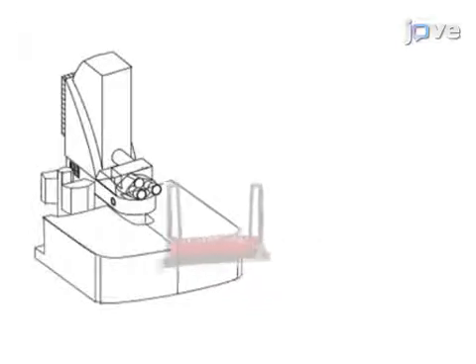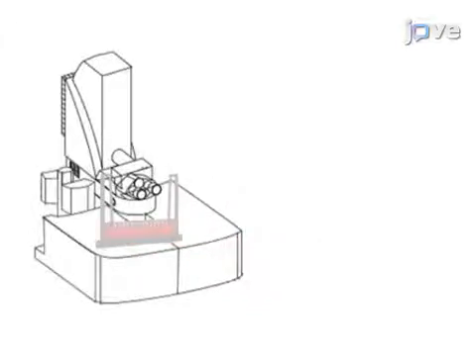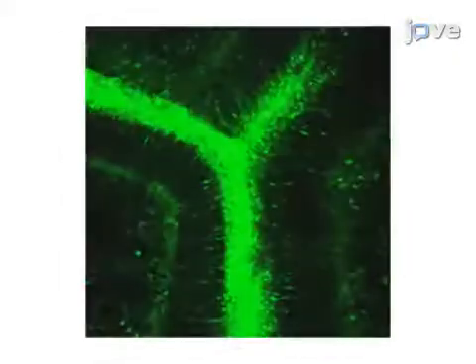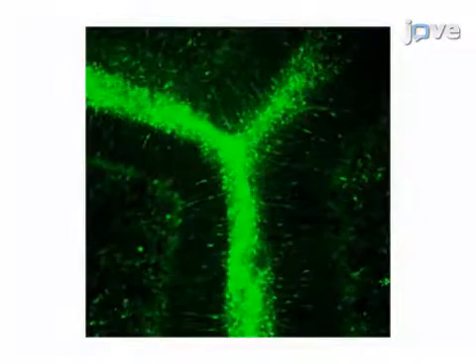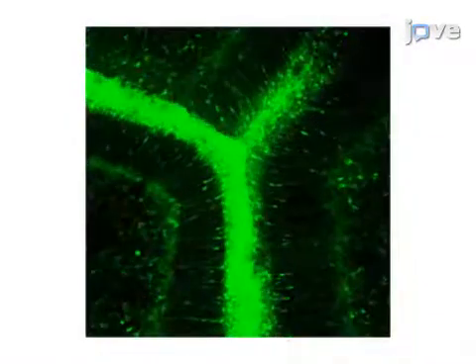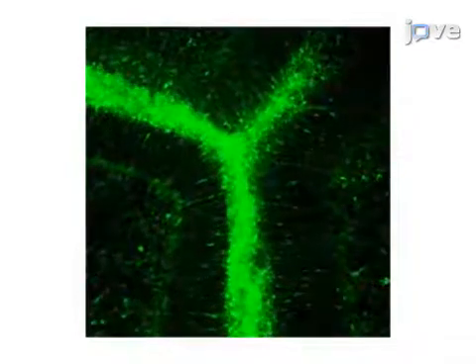Then, the time-lapse experiment is performed through macroconfocal imaging or confocal macroscopy. The final step is to track the neurons in the resulting movies. Ultimately, ex vivo macroscopy is used to show the role of endogenous factors or toxic substances that regulate neuronal migration.